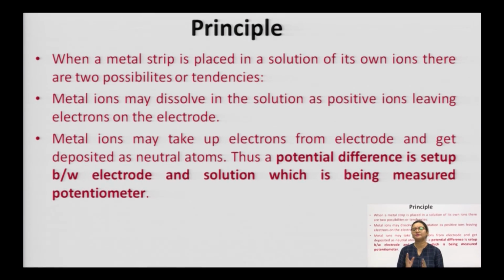Similarly, the indicator electrode shows a drastic change in the potential at the end point. So that's the purpose of the indicator electrode, which is directly related to the changes in analytical concentration, or the concentration of the solution in which it is dipped. तो indicator electrode का ये purpose है. Reference electrode हमारा बिल्कुल stable होता है, it is quite insensitive to the changes in the analytical concentration of the solution. The reference electrode has the purpose only for reference. उसको refer करके हमारा indicator electrode अपना potential change करता है जो हमें measure out करना है.